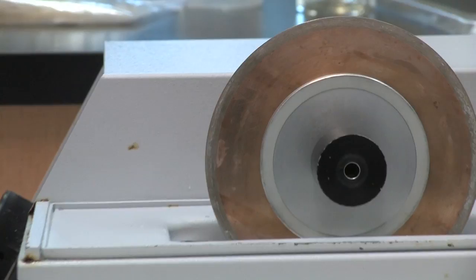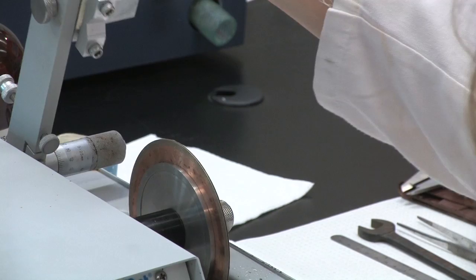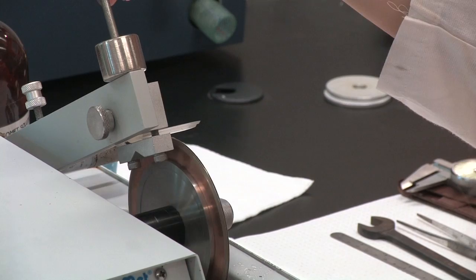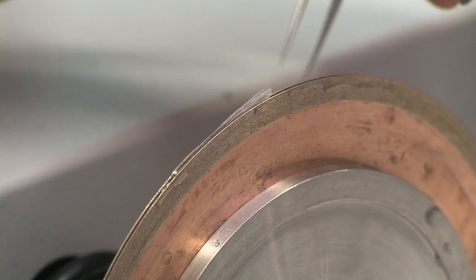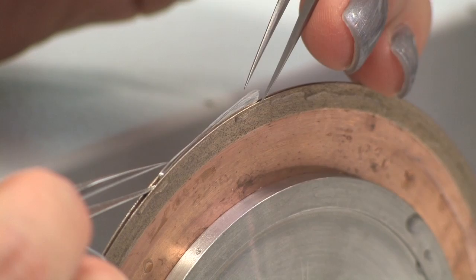Multiple blades can be added to the saw to cut up to three sections at a time, but typically only two blades are used to make two cuts at once. This produces one section through the sample in a single cut and reduces the chances of breaking the section, as can happen when making sequential cuts with a single blade. It is also much faster, especially when you have a number of samples to process.